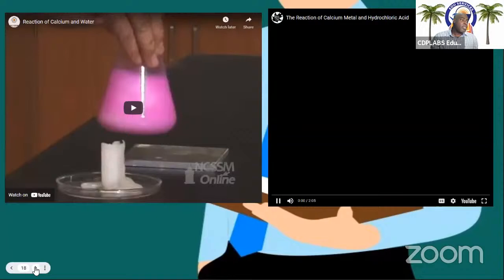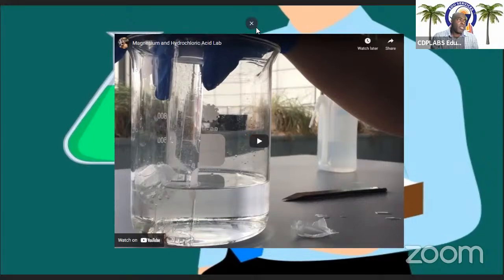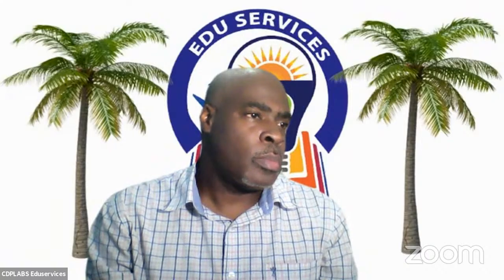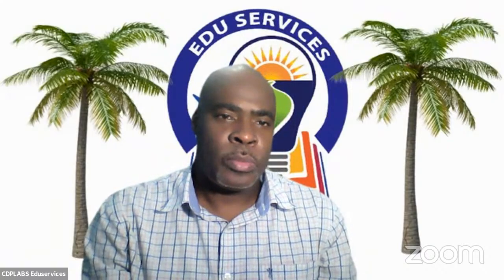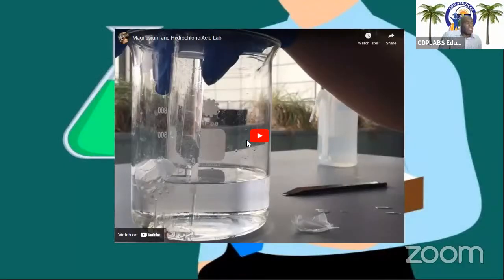So our last lab now, last video. This one now is magnesium in hydrochloric acid. Let's see what happens with the magnesium in the hydrochloric acid. So here we are in this video, right? Let's go.